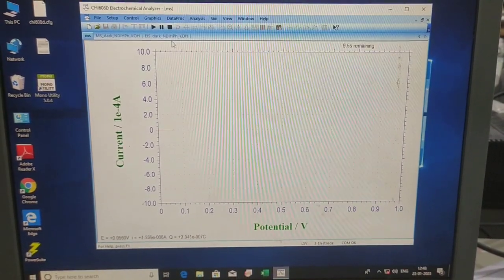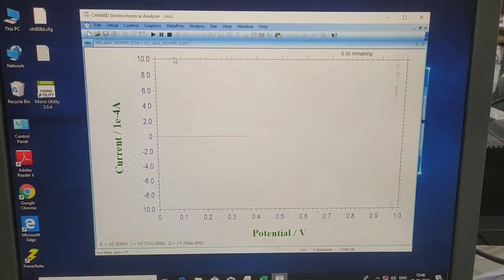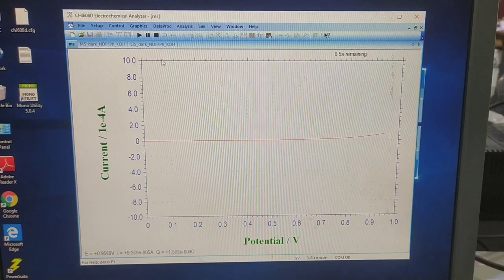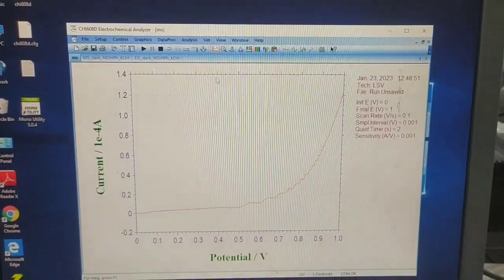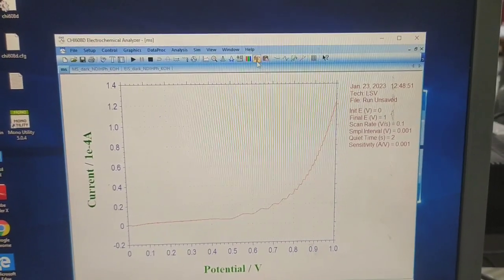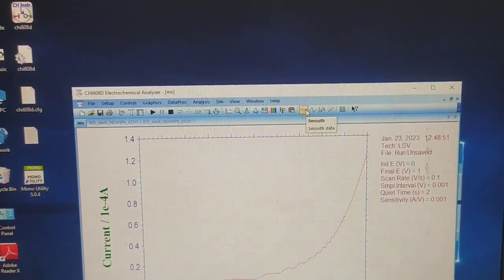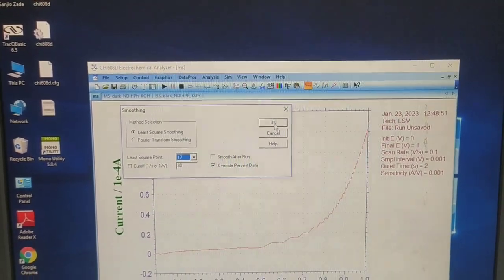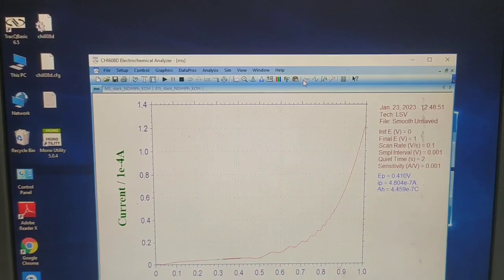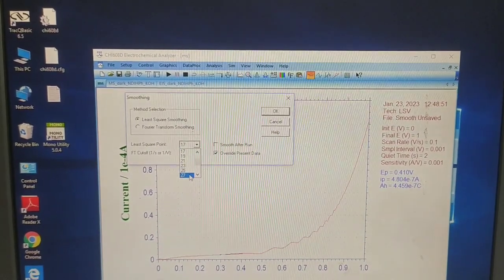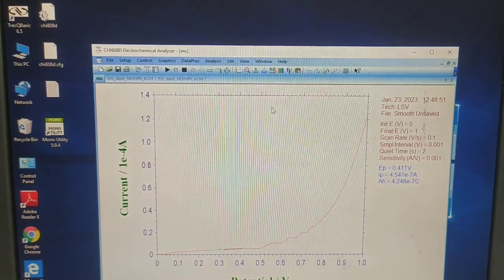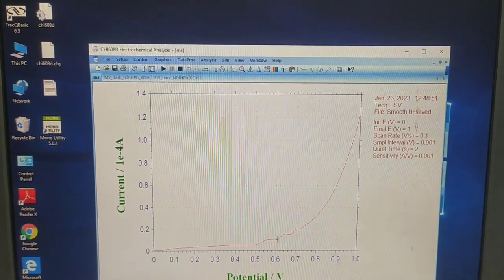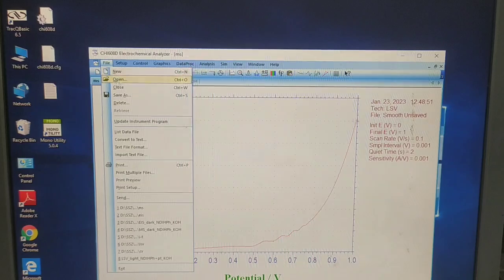Now I have the graph of LSV. Let's see this graph. Now we want to smooth this — just go to this icon and press here. Change the value here and you can see the graph is being smoothed. For more smoothing, change this value again and press OK. You can see the graph is smoothing by increasing this value. That is fine — now just save it.